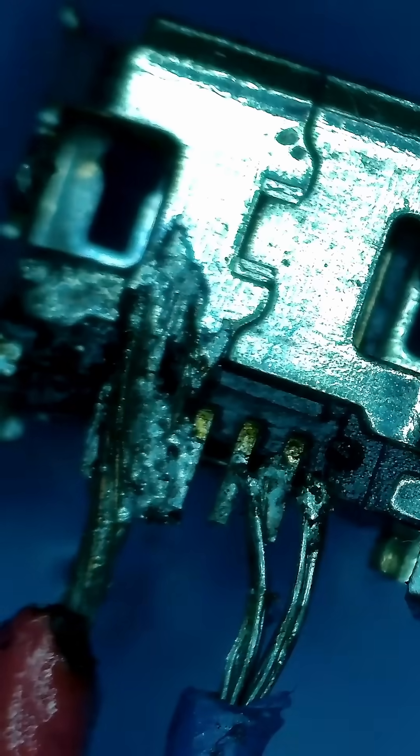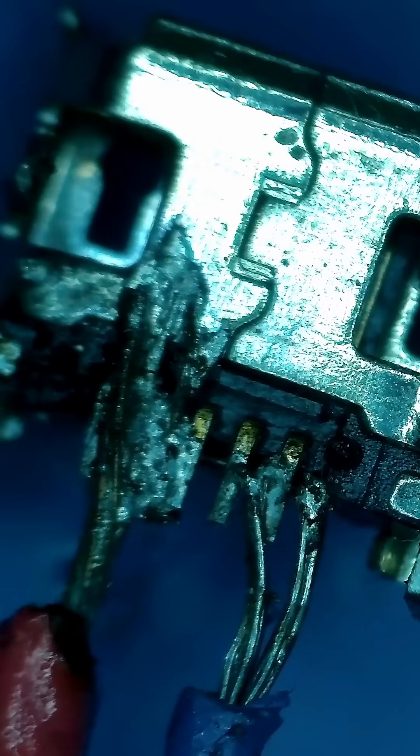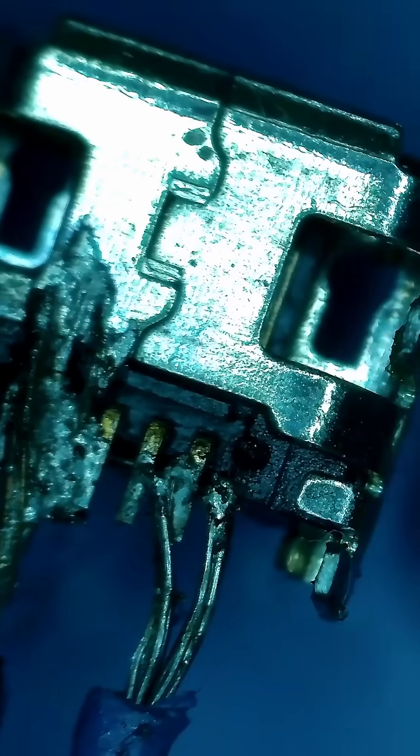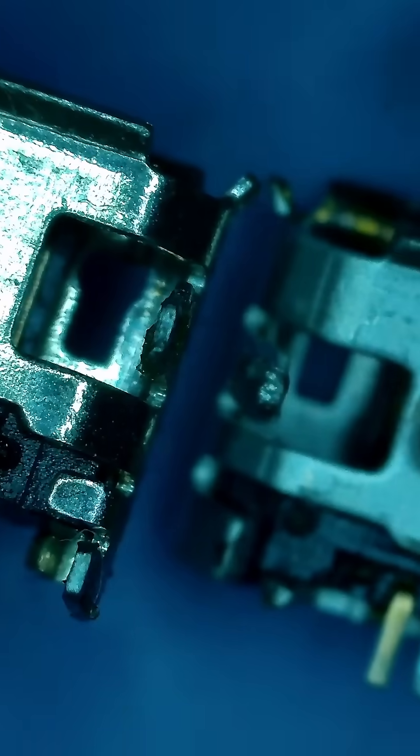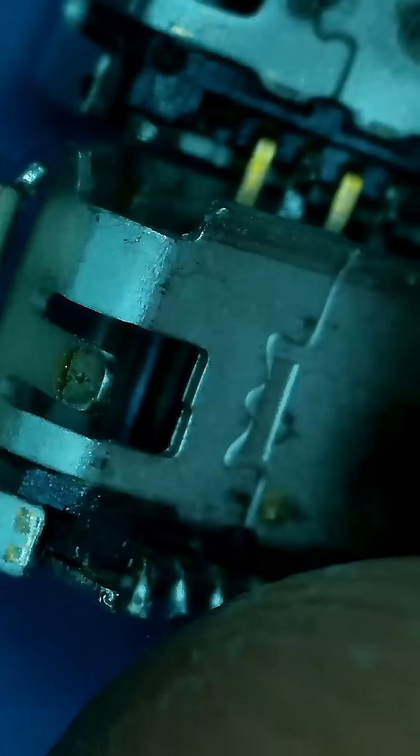Voiceover here. I'm not gonna bore you with too much footage since this repair took many many hours. I started out by finding some USB micro ports I had removed from other things. Then I compared them to the original one just to make sure I would have backups — and boy did I need them.